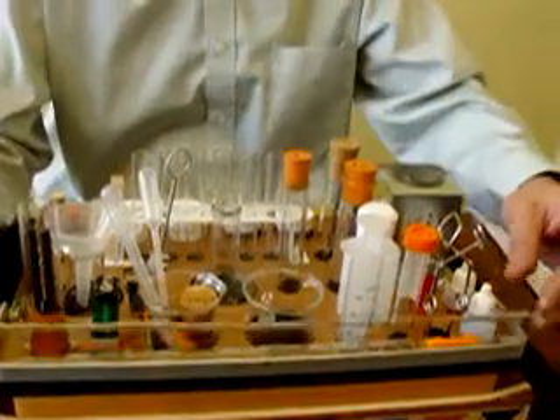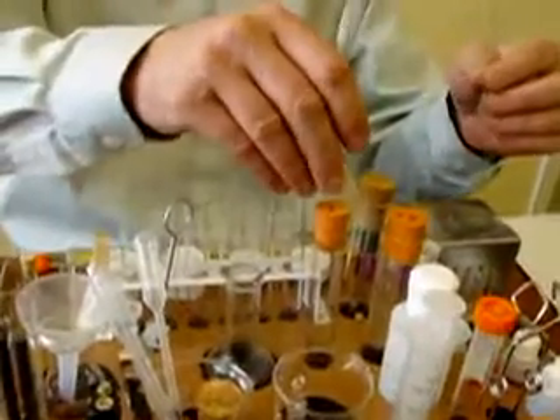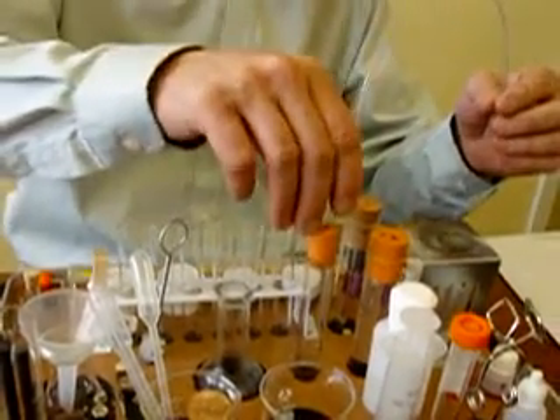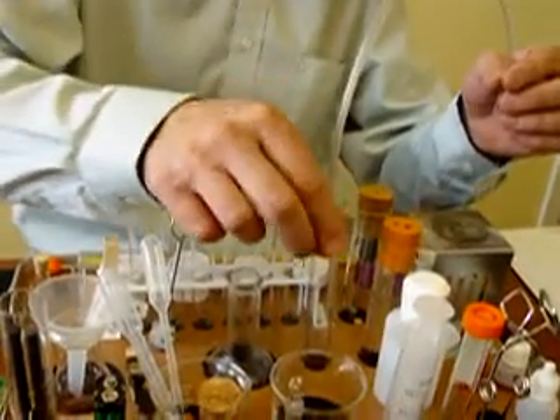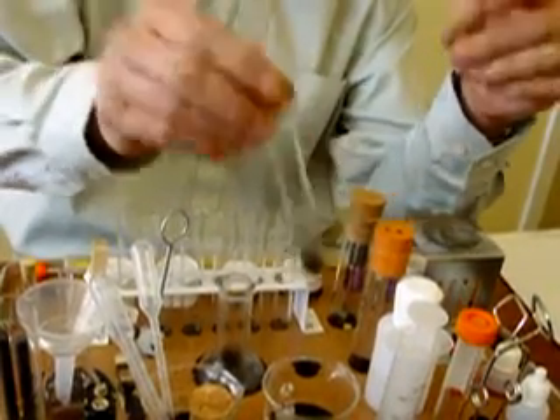In this experiment we're going to burn sulphur in oxygen. We're first going to collect the oxygen. I'm going to put that delivery tube into this smaller test tube with the one hole stopper at the top, and some potassium permanganate that's been placed near the bottom.